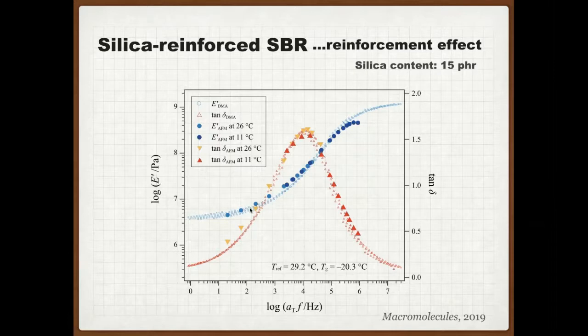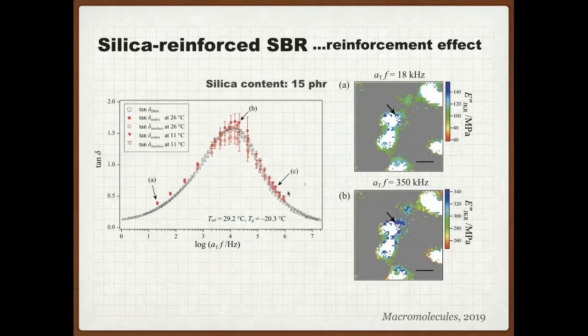But this is the average data over all of the samples. But our technique has spatial resolution. So we divide the responses into matrix region data and interfacial data. Matrix and interface give different responses. And very interestingly, the macroscopic data comes in between. So by thinking of some new calculation method, maybe from the nanoscopic data, we may be able to predict the macroscopic data. This is an ongoing project.